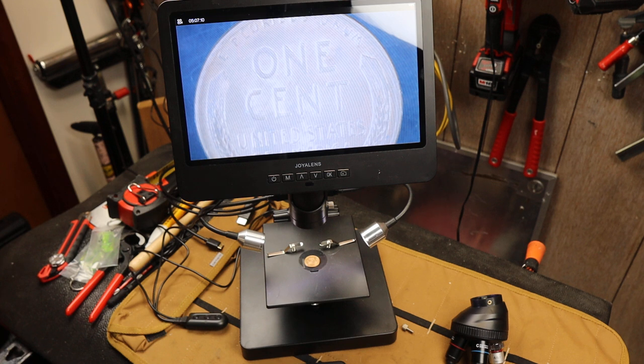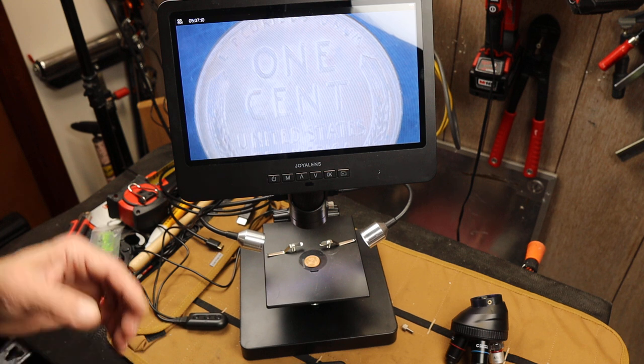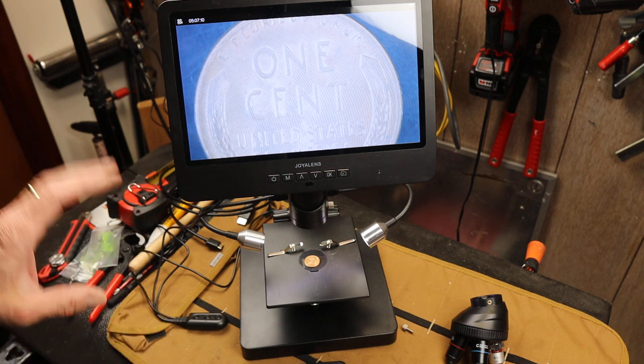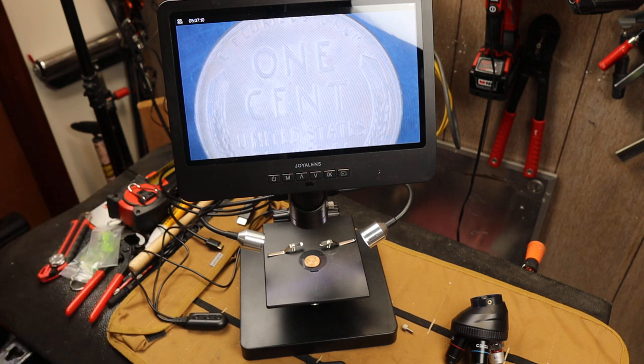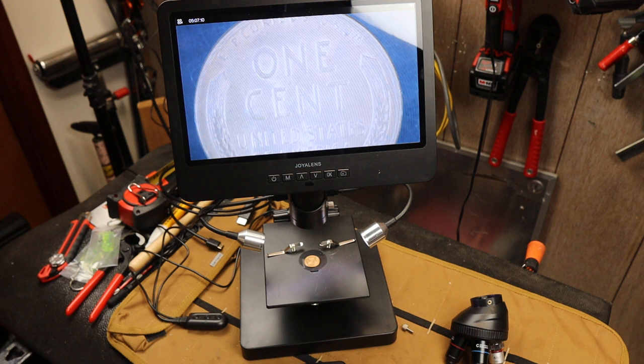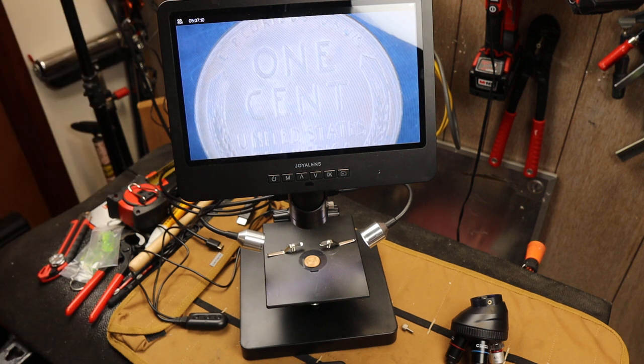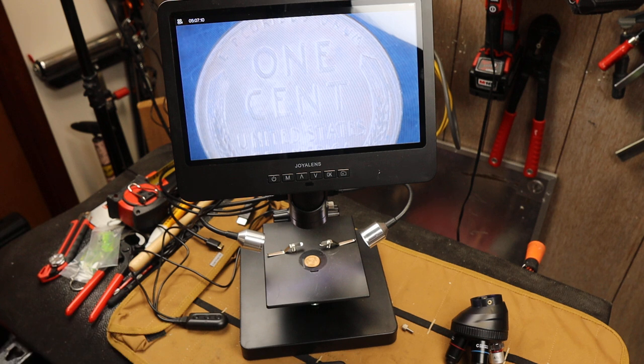On the still image resolution, just taking a picture, it shoots in the JPEG format, by the way it shoots MP4s in the video. But it records to an SD card, and I can shoot up to 24 megapixels with the still image, so that's pretty amazing.